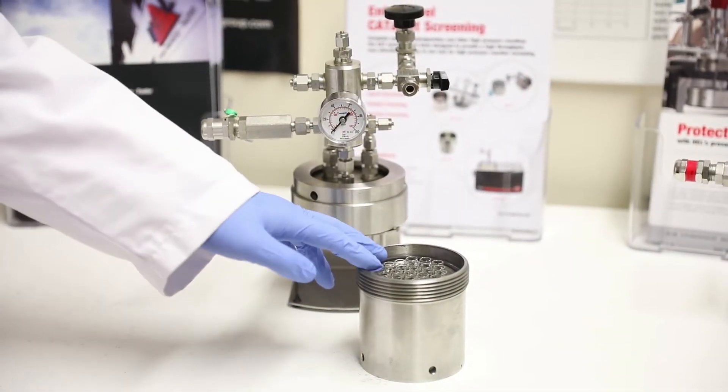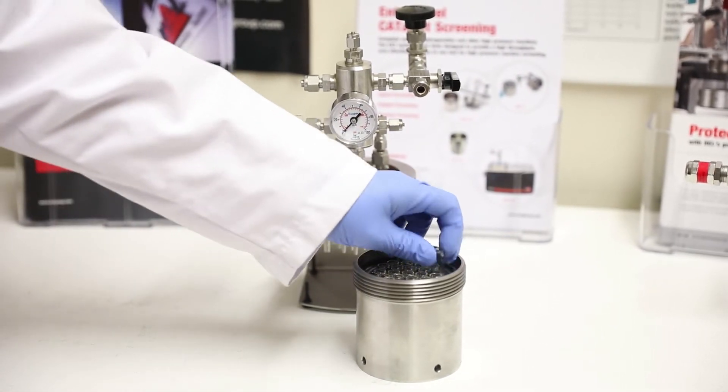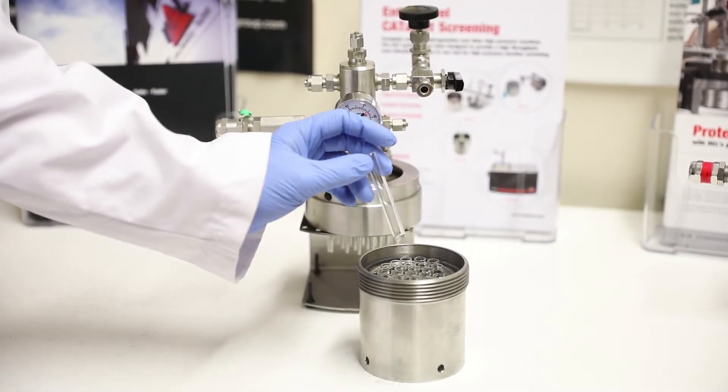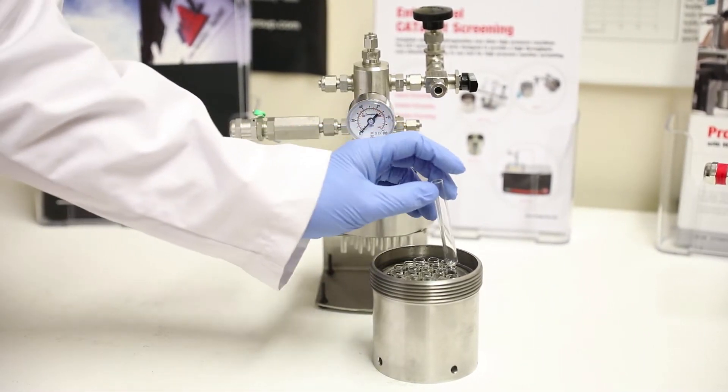Next we have our CAT 24. Like the CAT 7, it has multiple reactors within a single block. Although here we have 24 reactors and they're these small two milliliter tubes, and you can put a small magnetic flea in the bottom if you want all of those to be stirred.